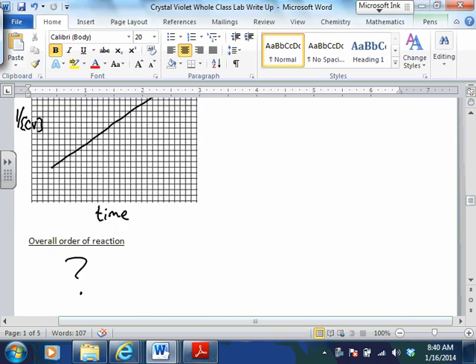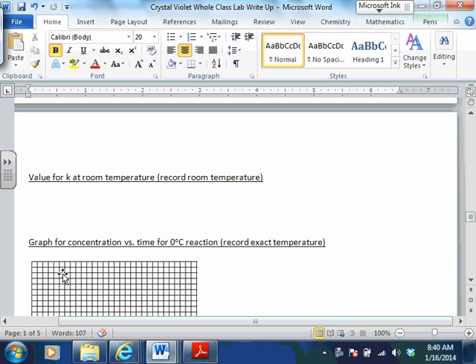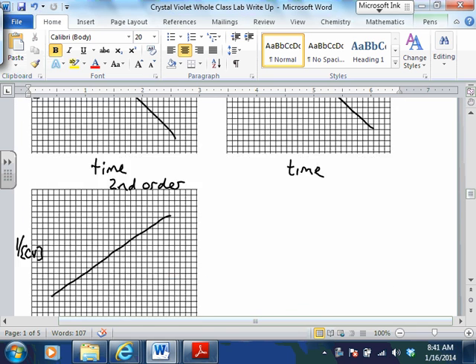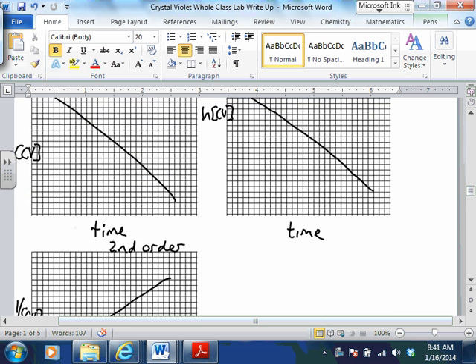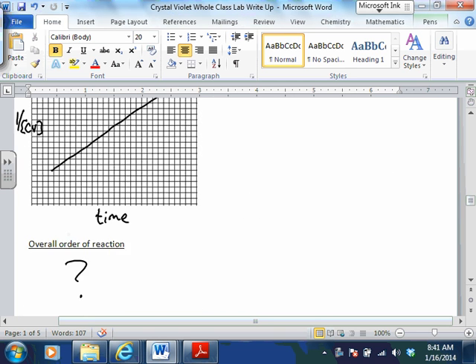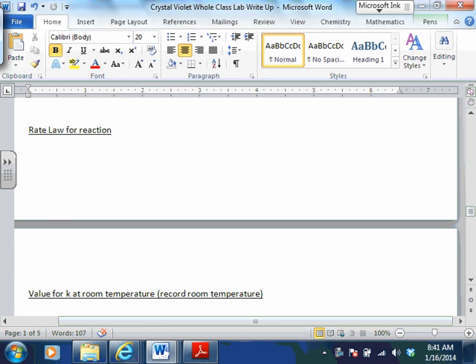Okay. So again, you can't really find the rate law for the reaction just based on knowing that order because you don't know what the order for the hydroxide is. We would have to figure out some way to measure the concentration of the hydroxide and how that changes over time. Sorry, still made a mistake in this video even after all that. But okay, so just let me back up here and make sure that you understand what I'm saying. Since we're graphing the concentration of the crystal violet versus time, we're finding the order of the reaction with respect to crystal violet, okay? Which is not necessarily going to help us find the overall rate law.